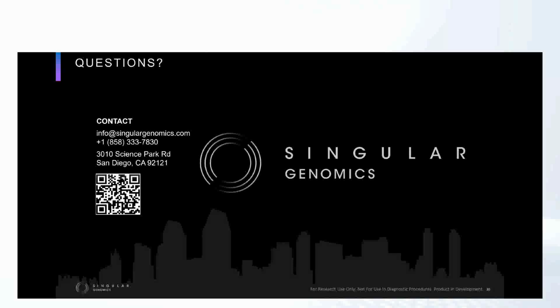Nice. Does it do Z stacking? We do multiple Z layers of the image of each tissue section, I think 3 to 5. I'm not sure of the exact number. Yeah, within the individual section, we do 3 to 5 Z planes.